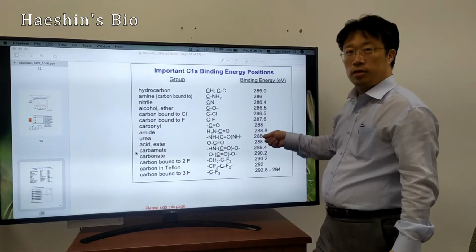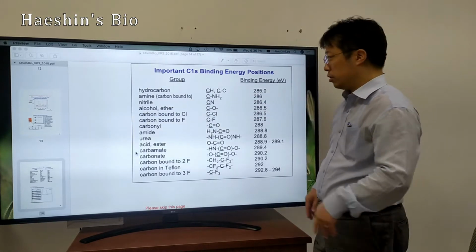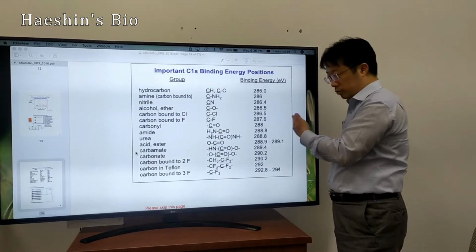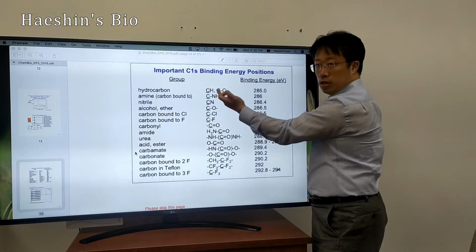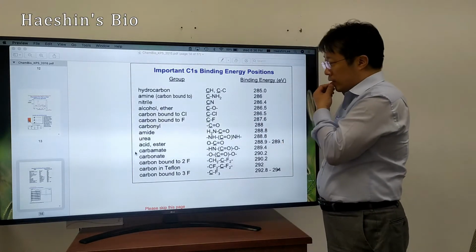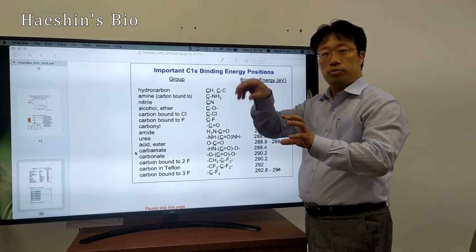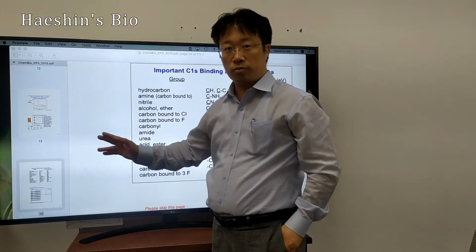If this is like a lipid, just a carbon chain, then the chemical shift in ppm is low, upfield. But in the case of NMR where you have some electronegative atoms, and then the carbon, and the proton connected to it, now we have downfield shifted, downfield shifted more.